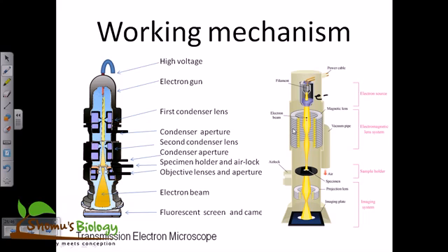Remember, whatever lens we use in electron microscopy, either TEM or SEM, the lenses are made up of electromagnets. So they are all magnetic lenses, because here the idea is the electron is negatively charged, but the lenses that we see here are all positively charged. All the time they're positively charged, so they are kind of anode. They behave like an anode there, so that the electron can migrate towards that magnetic lens.